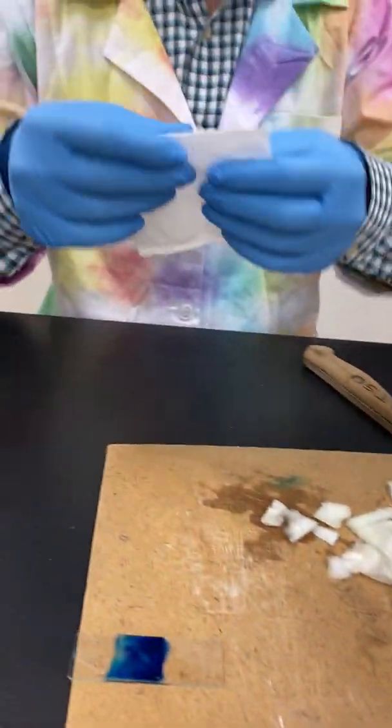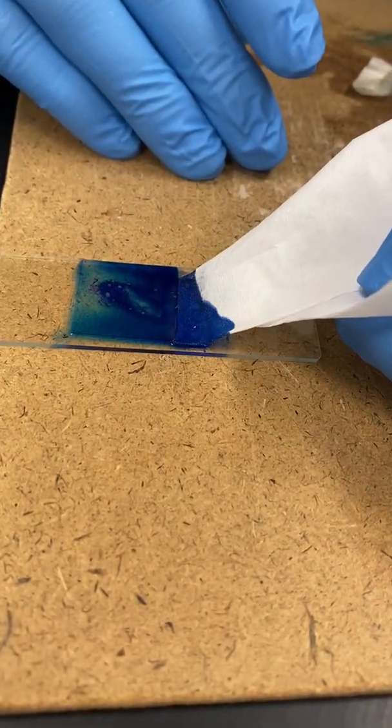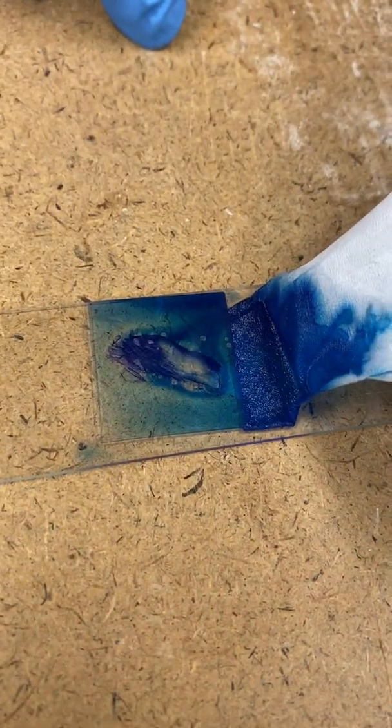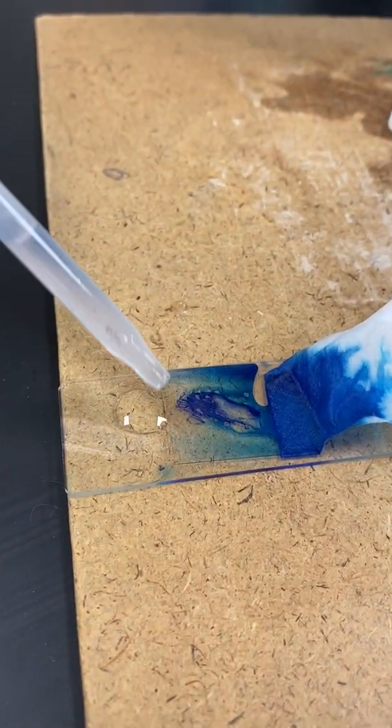There we go. Now we have some excess fluid on this slide, so what I'm going to do is draw off some of that — it's going to give us a better view of our specimen as well. I'm just going to put that chem wipe right there. You can see the dye being pulled out from underneath the cover slip. If you want to get rid of a little more dye, put another drop of water on that side, and you can see it being pulled underneath the cover slip and across to the chem wipe, washing away excess dye.